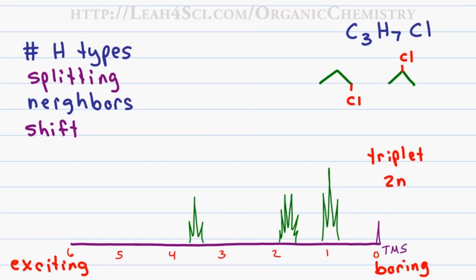And finally, the shift is all the way to the right, meaning this group of carbon and hydrogen atoms is on the most boring end of the molecule, or as far away from the Cl as possible. For the second peak, I count a total of 6 tips, and that gives me a sextet. Using the reverse of n+1, I know that I have 5 neighbors. The shift for this peak is slightly away from the boring region. That means given the chlorine on the molecule, the hydrogens responsible for the second peak are going to be closer but not closest to the chlorine atom.